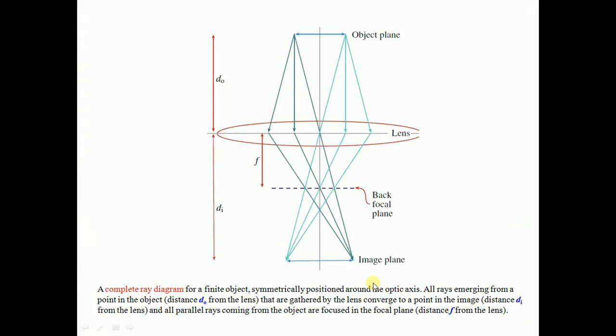So depending on position, as I told, this should be in the back focal plane and image plane, where when you put your aperture at the right position, you get the SAD pattern. Selected area electron diffraction, SAED. So I will tell you what the long form is. Electron diffraction, ED, is there.